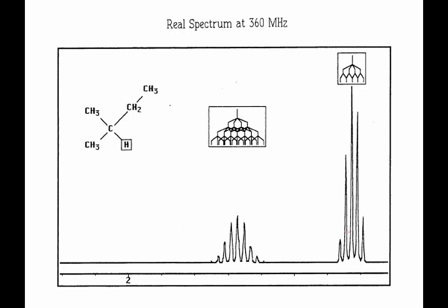So whenever you're doing biomolecules, most of the time you need a minimum of 600 all the way up to 900, or I'm sure somewhere in the US there's a 1, whatever the next would be, terahertz or something, that there's a magnet that big, and a building even bigger to fit it in. And somebody had to pay like $20 million for that, or maybe even 30. Usually when you go from 300 to 600, you double the price. When you go from 600 to 900, you double the price again. So if we wanted to do a lot of biomolecules here, I should have bought the 600 from the guy in Case.